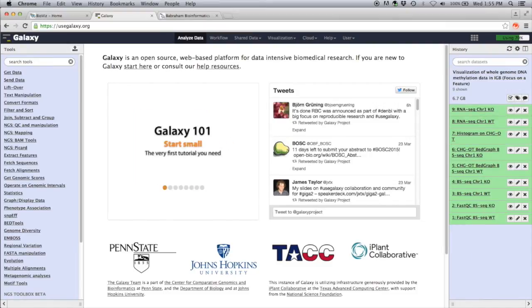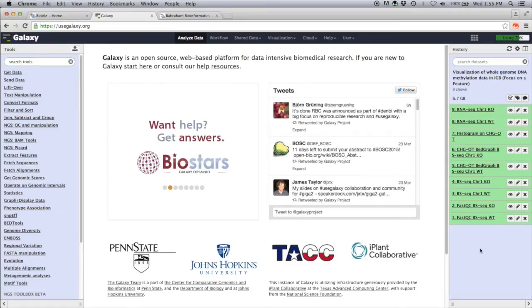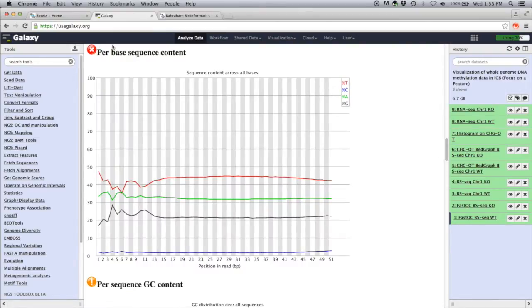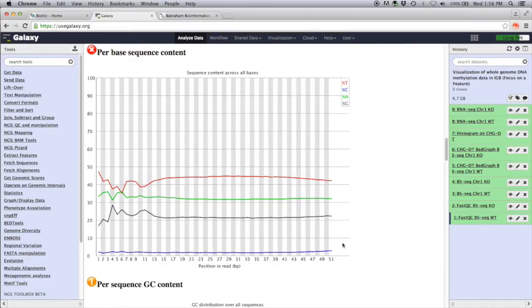The first thing we can do is look at our FastQC file. Any time you're about to embark on analysis, you probably want to start with FastQC to make sure the reads look good. Our bisulfite-converted reads will look a little different — if you click on per base sequence content, it's marked with a red X. But in reality, our thymines are increased and our cytosines are decreased to about 2–3%, which is what we expect because the vast majority of cytosines have been converted to thymines. Only the methylated ones remain as cytosines, so while this looks like an error, we know it's not.